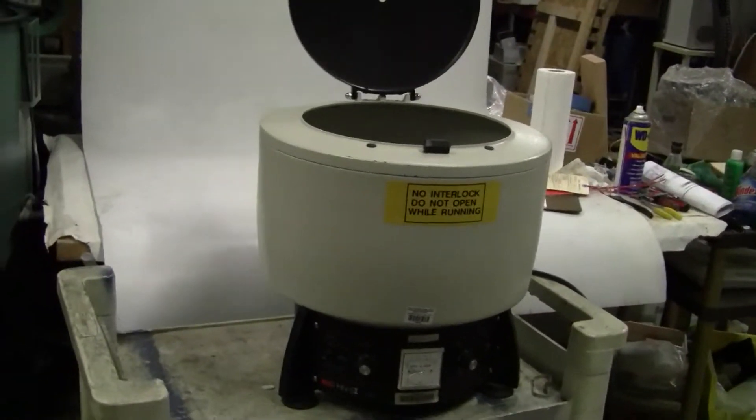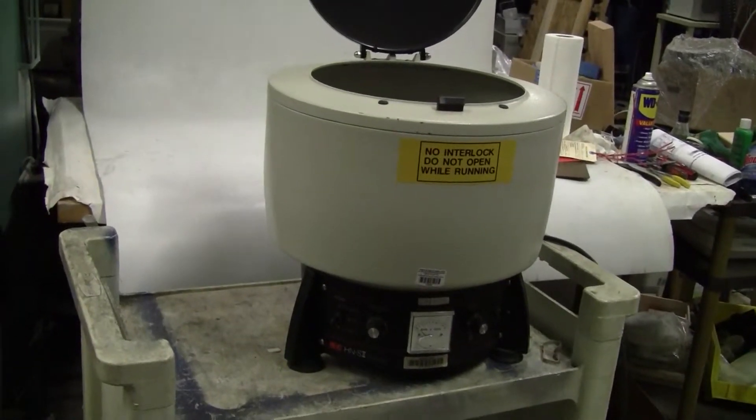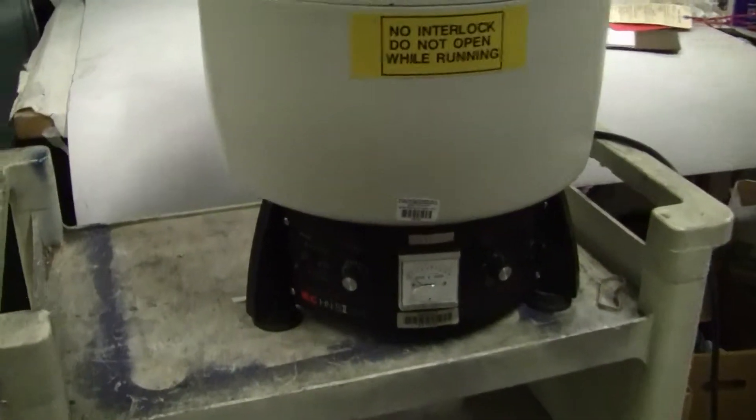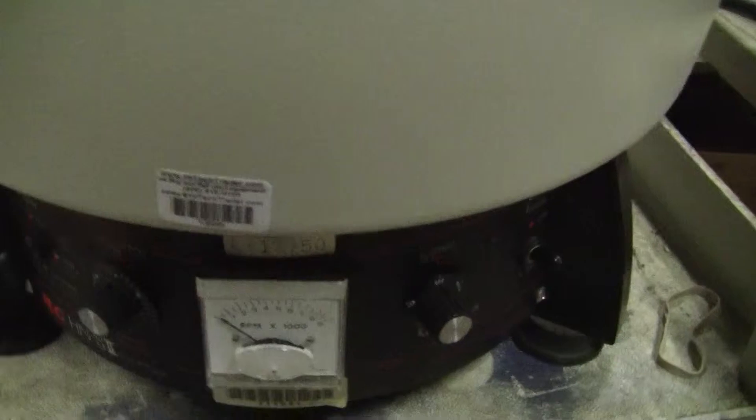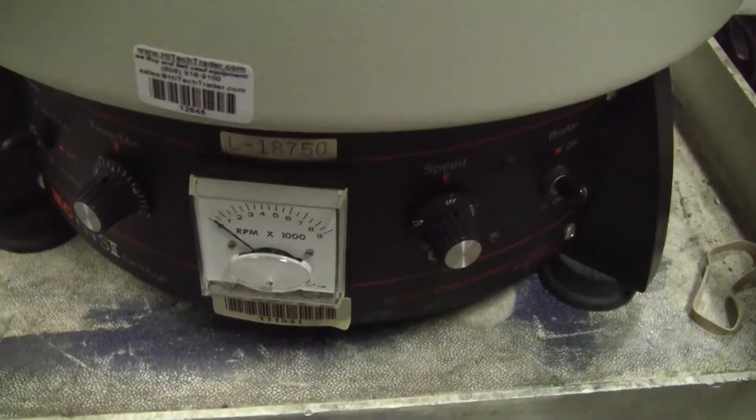Hi, this is Jim from HitechTrader. We're looking at an IEC centrifuge model HNSII. It comes with a top speed of 9000 RPM. It has a tachometer, as you can see, and a 60-minute timer.